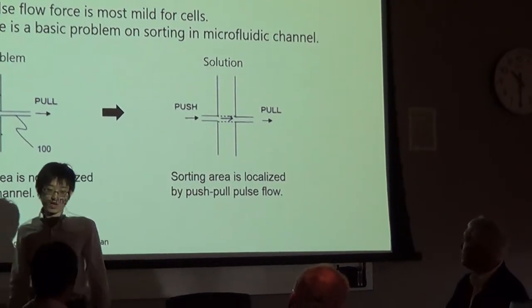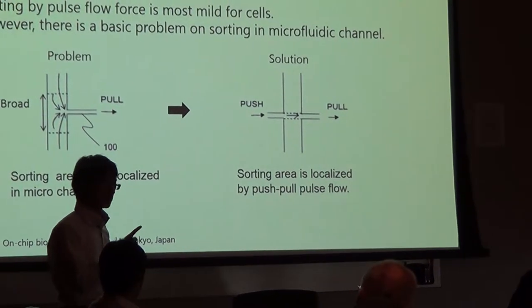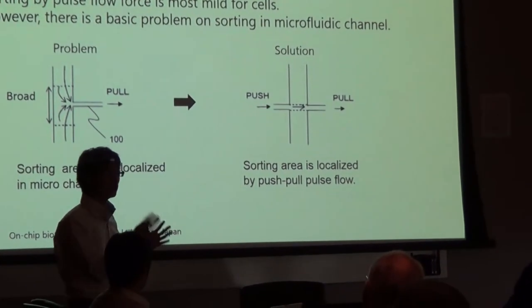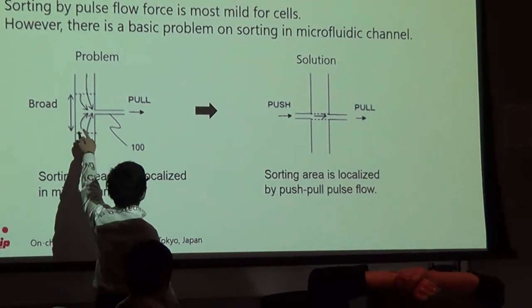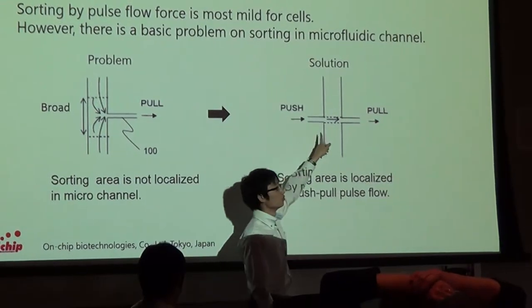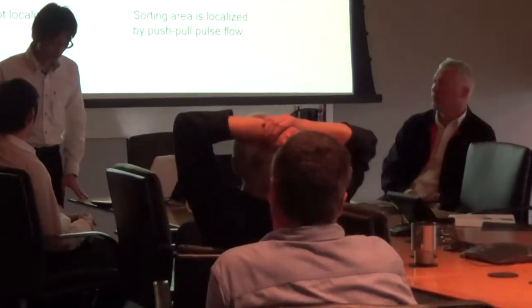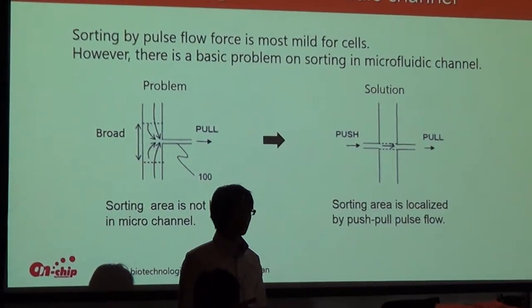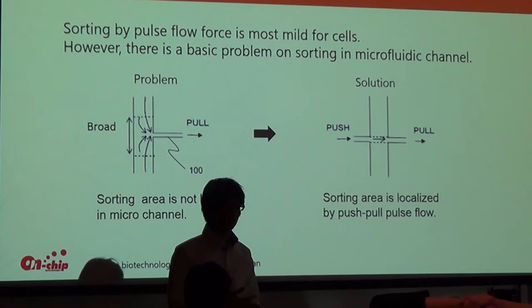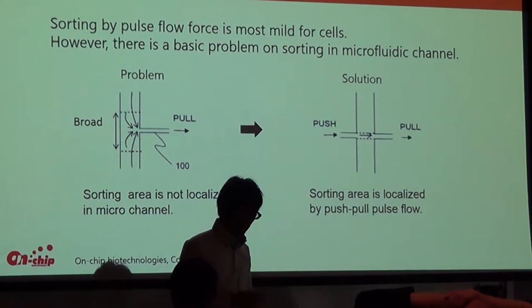What this means is that whatever you don't want, the non-target particles and cells that are flowing around here, we can reduce that as much as possible. So it reduces debris. Exactly. That means the yield and the purity of the collected sample at the end, we can get relatively high.